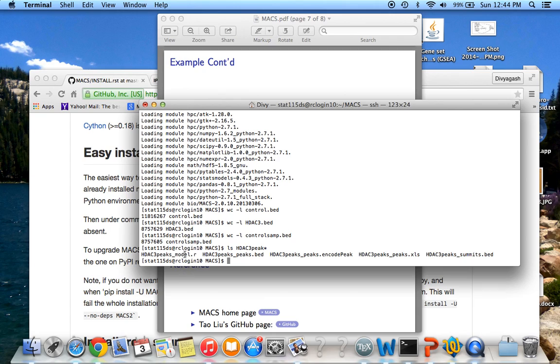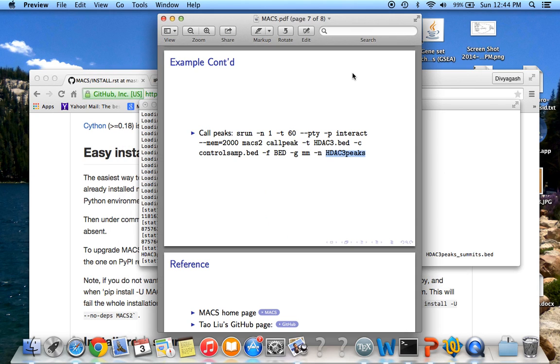After running callpeak, I get five different output files: an R file, a peaks.bed file, a peaks.encodedpeak file, an Excel file, and a summits.bed file. Each of these files gives different results about the ChIP-seq data, and you can use the information from these files along with differential expression data to further understand transcription factor binding.